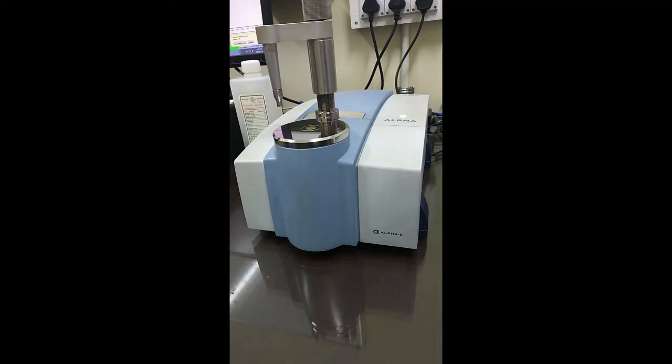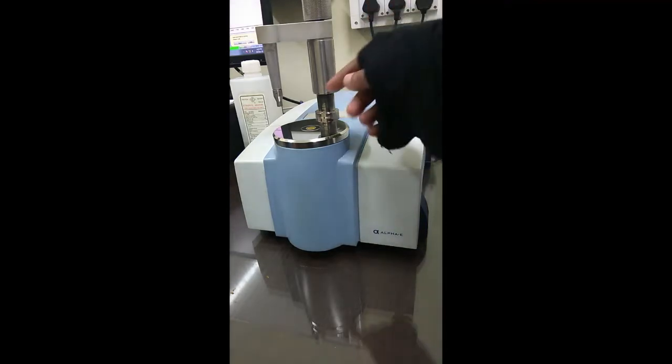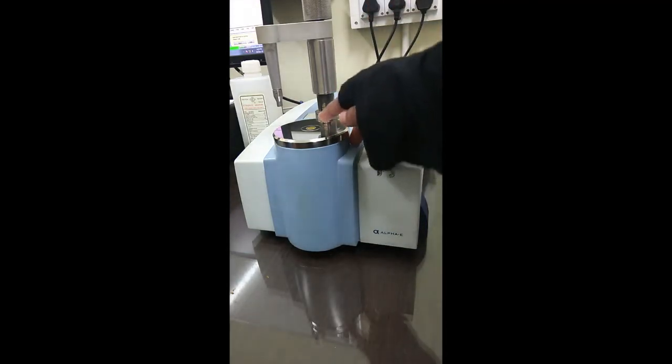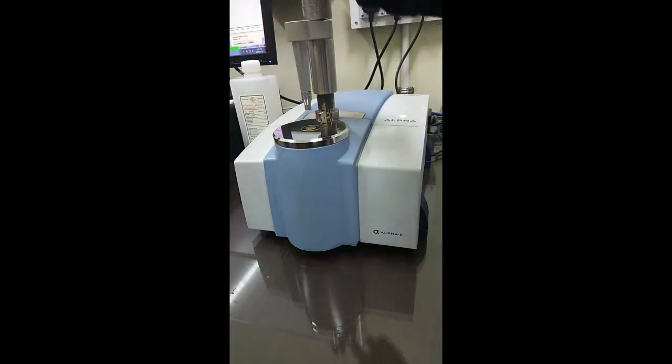There are a few things that we have to take care of. For example, if we are using a solid sample, we put a tiny amount of sample on the ATR crystal, and we put force with this probe so that there occurs maximum contact between the sample and the ATR crystal.